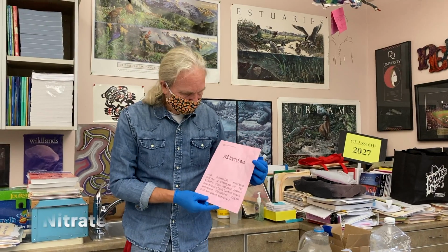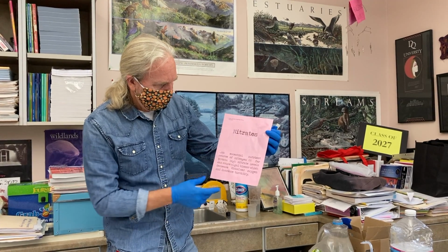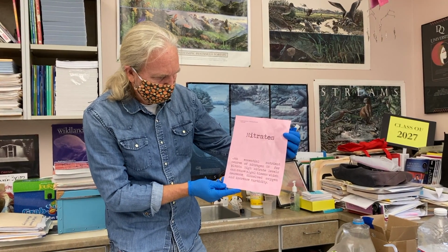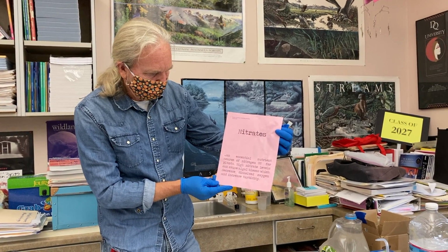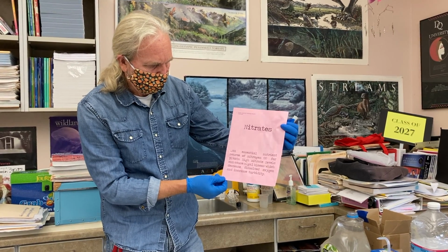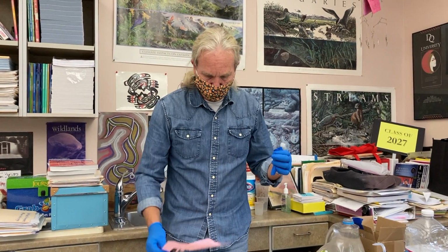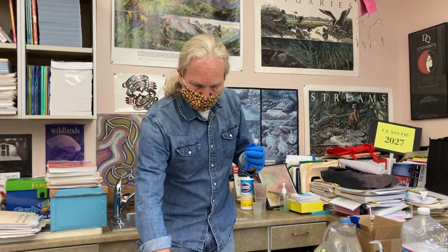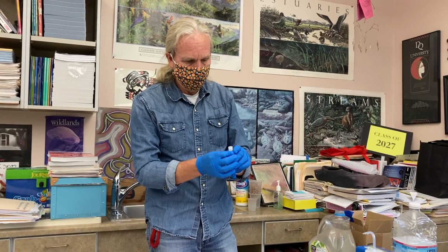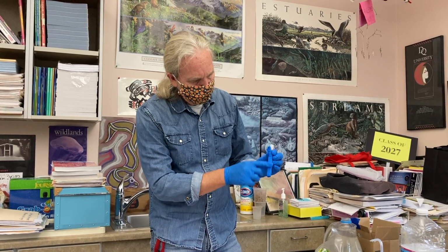Okay, we're on to our third water quality test, nitrates. And this is an essential nutrient source of nitrogen. And for plants, high nitrate levels can cause algal blooms, which decrease the dissolved oxygen and increase turbidity. Yeah, so we get runoff from farms or cattle or dairy farms. So those all contribute to nitrates. Soaps and detergents, those are nitrate sources. So we've got it covered a little bit.